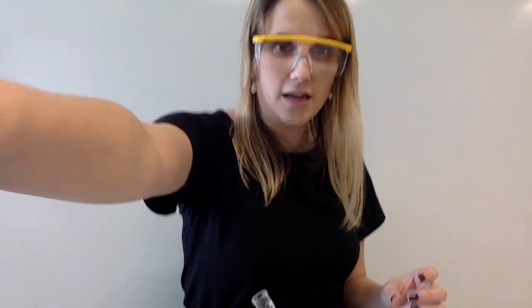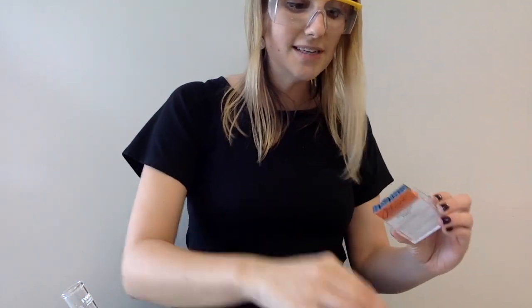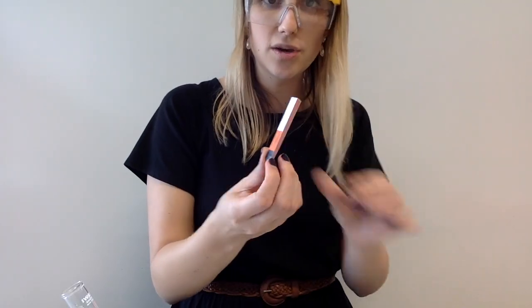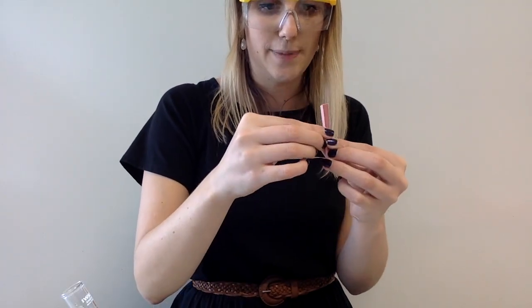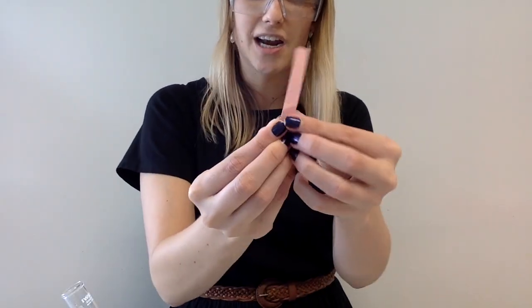In my solution here, you can see I'm just warming up very, very gently, and the way we test for ammonia is we use red litmus paper.